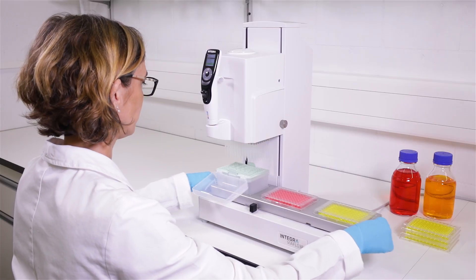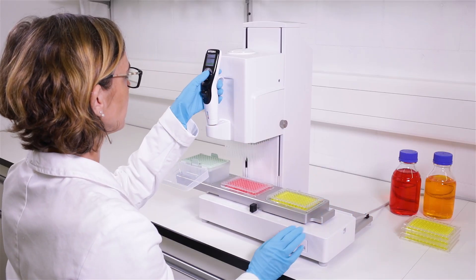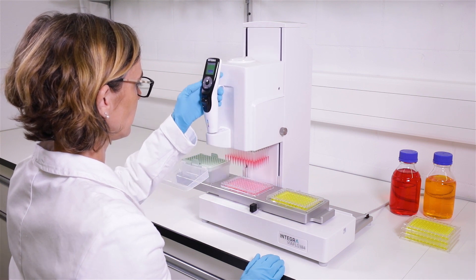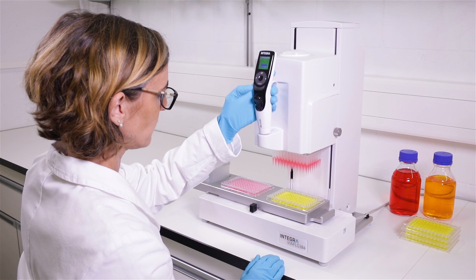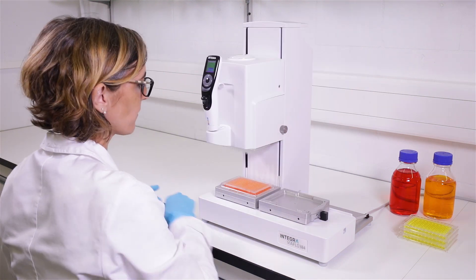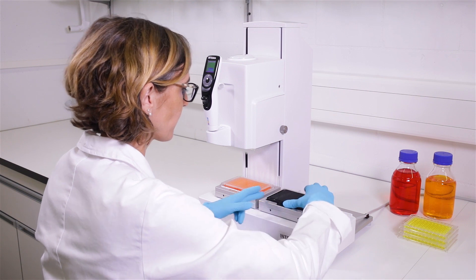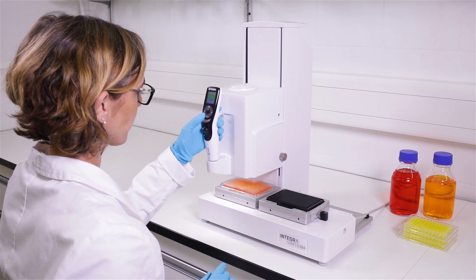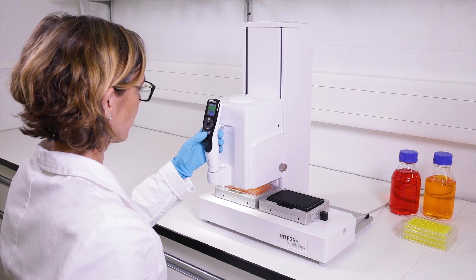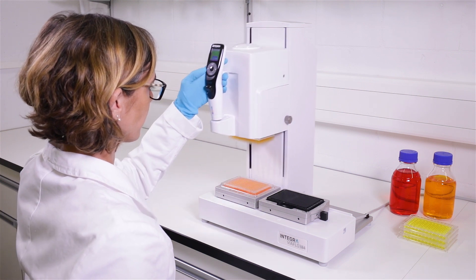A three-position stage extends your working positions to minimize plate handling and optimize your workflow. VIAFLOW 384 enables even 1536-well pipetting. This high-precision pipetting task can be carried out by using an optional 1536-well plate holder.